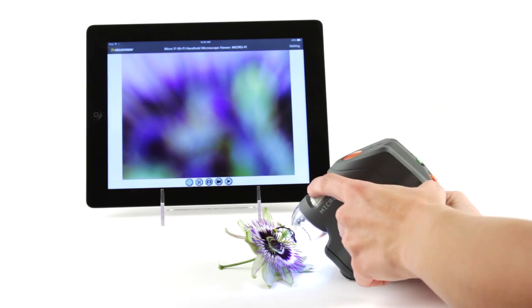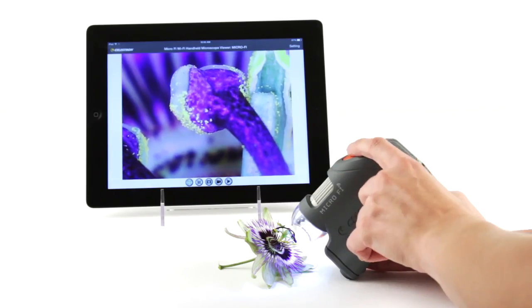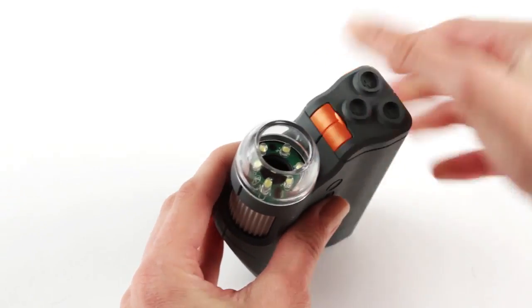Once you have a perfect view, press the button or tap the screen to save a still image or video. MicroFi runs on AA batteries, so you can keep it powered up for a whole day of observations.